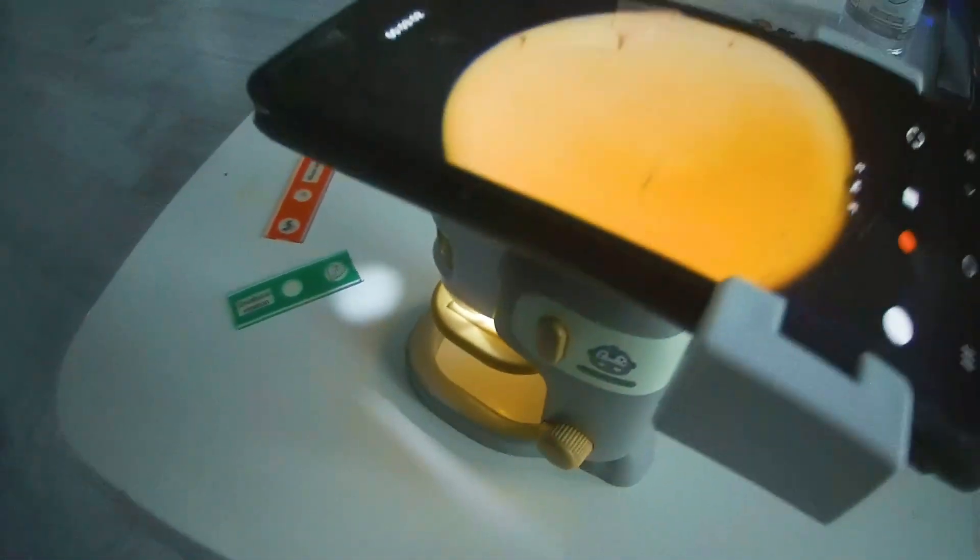They also give you this really handy smartphone mount, where you attach this to the lens, and you point the phone this way, so then the phone goes over top of here. That way, you get to record what you're seeing.